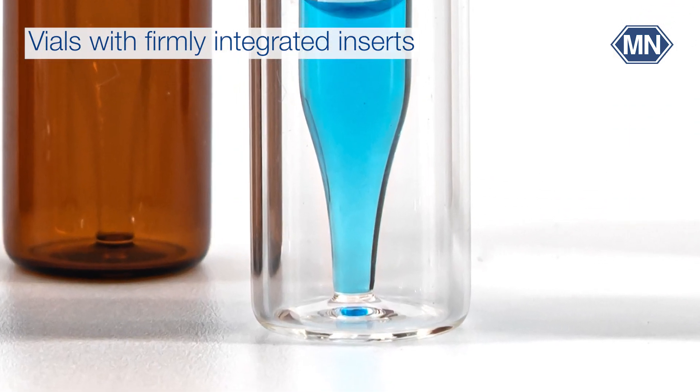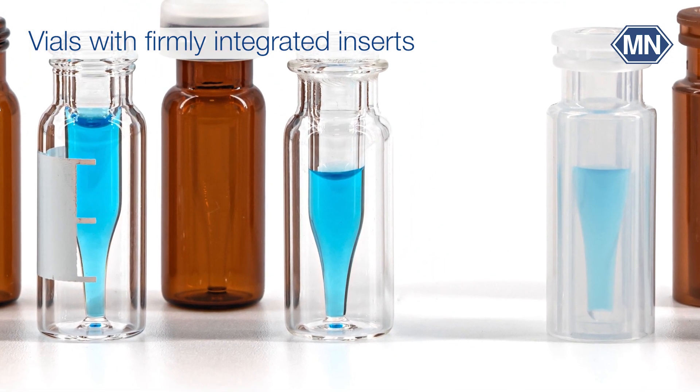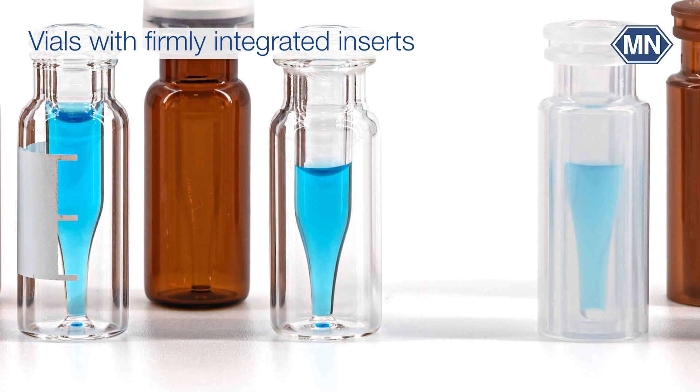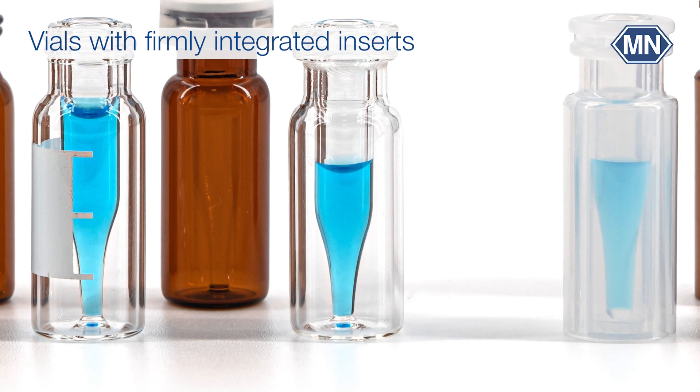Sample removal is carried out without any risk to the needle due to the reliable centering of the micro insert. The risk of contamination is always lower with ready-to-use sample containers in comparison to individual components that still need to be assembled in the lab.